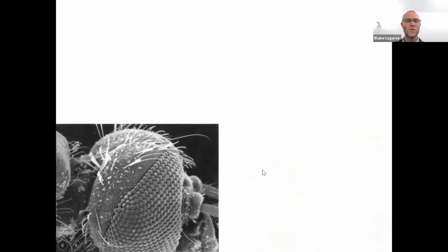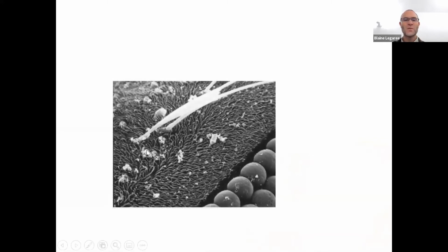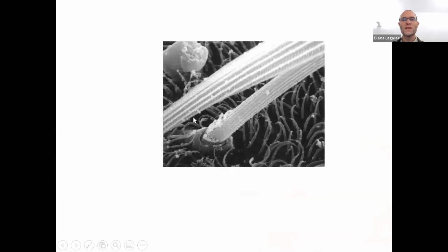So in this case, you can see we're looking at the bug's head. So there's the mosquito head. I know what you're thinking. It's so beautiful. Well, probably not. It's an image only a mother could love, I think, from a mosquito. Zooming in, you can see we can zoom into those hairs, and we can just keep zooming in. We can get some amazing magnification from scanning electron microscopy. We'll look at those hair fibers. We can actually make out some detail, and we can even zoom in and see the individual proteins right in the hair. So a very, very incredible image from electron microscopy.